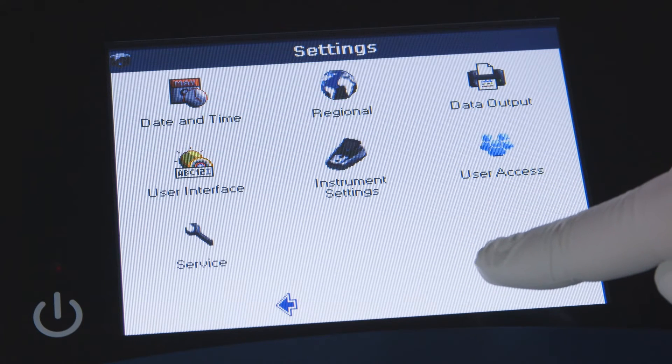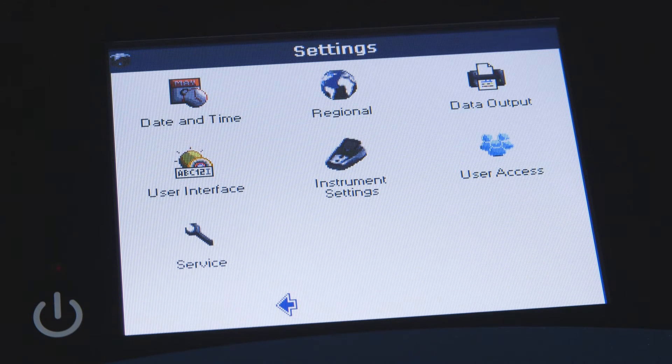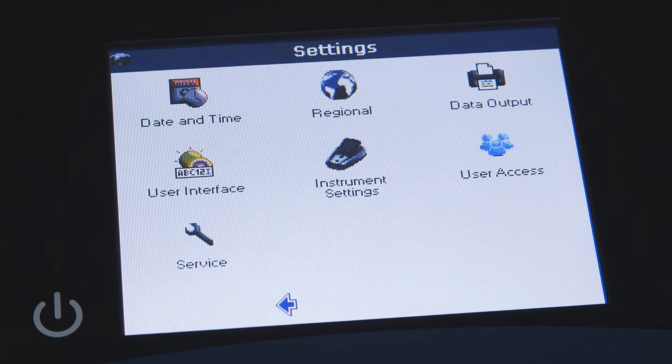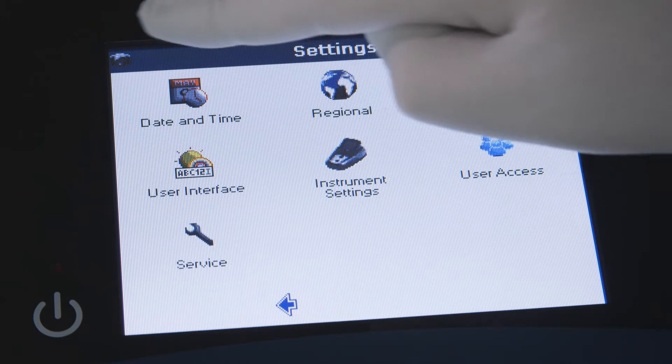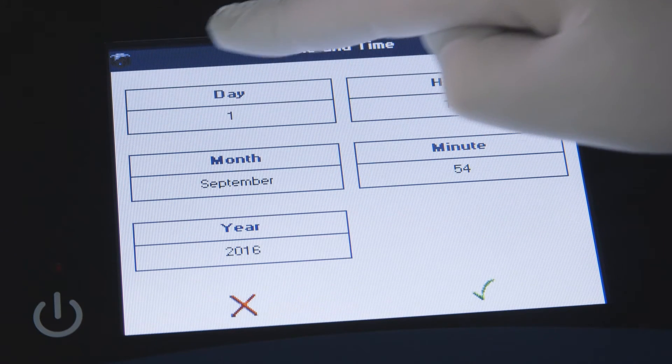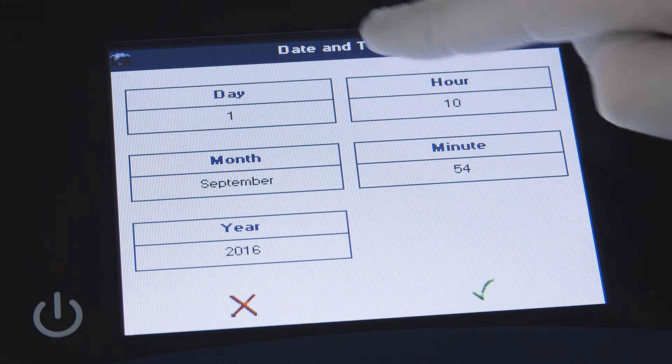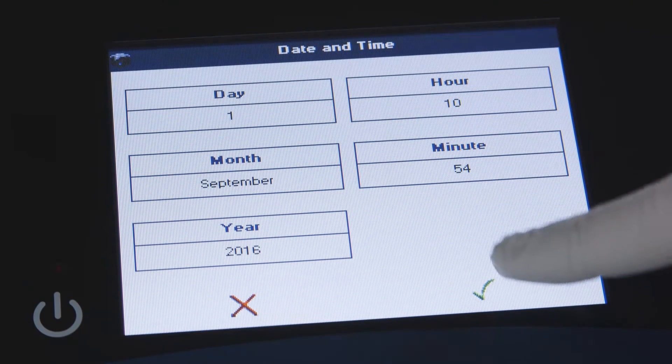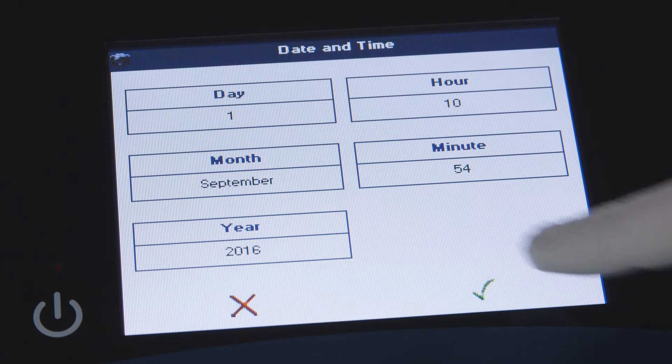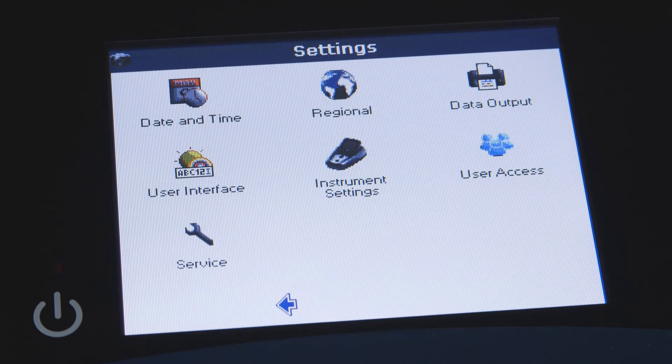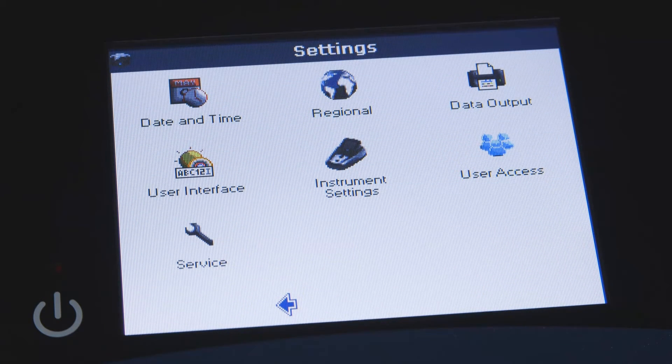The QuickDrop Spectrophotometer date and time preference is set to Pacific Standard Time by default. This can be changed by touching the date and time icon from the settings window. You may continue to personalize your QuickDrop Spectrophotometer from the settings window.